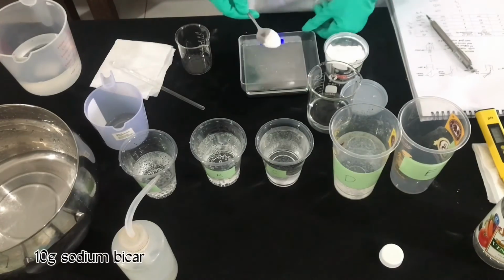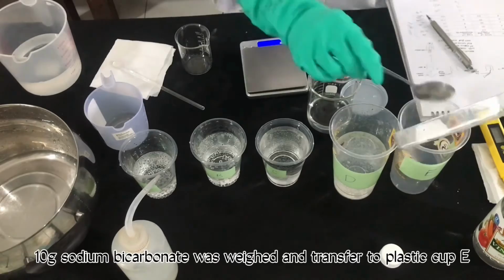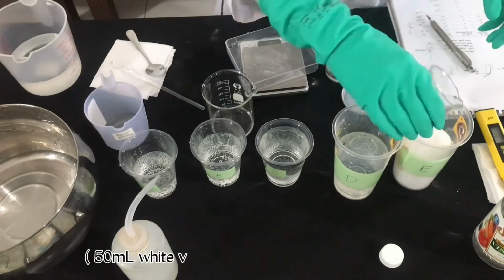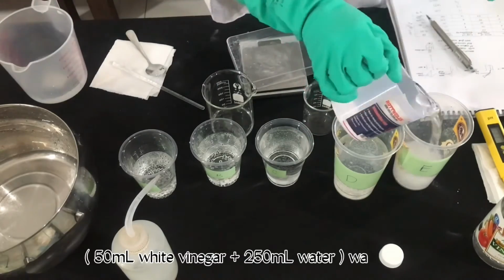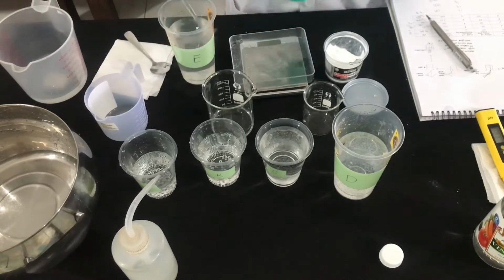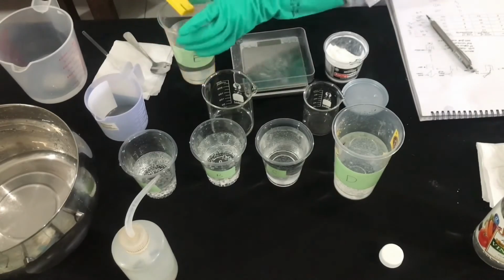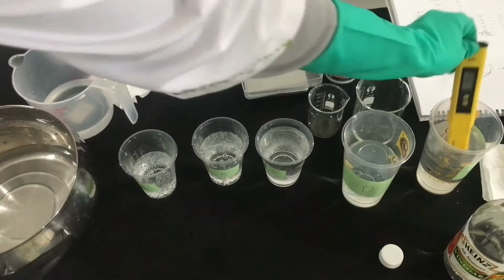Next, for the last cup, 10 grams of sodium bicarbonate was weighed and transferred into a plastic cup. 50 ml of 0.83 molar white vinegar and 250 ml water was added. The solution was stirred until all the sodium bicarbonate was dissolved. I measured the pH value of the cup and I get 7.56.